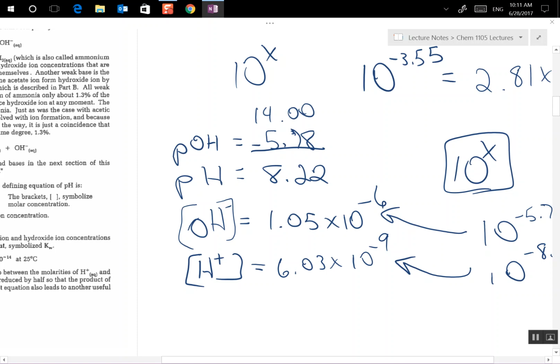The pH meter is very simple to use. You put the probe into your solution, and it gives you a readout. It says the pH is this. It's measuring the H plus ion concentration through conductivity of the H plus. Okay, so it has a probe that's measuring how conductive it is for the H plus ions that are present. All right, and that gives you the pH of the solution based on that. So you have those 4.